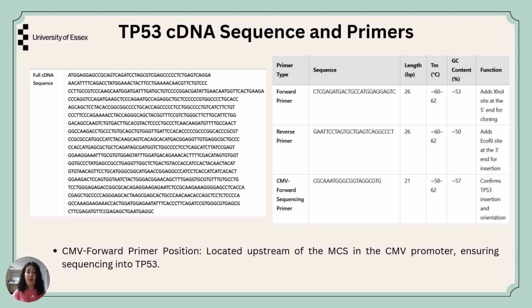As you can see, I have the full cDNA sequence here, and we can see the forward primer and also the reverse primer here.